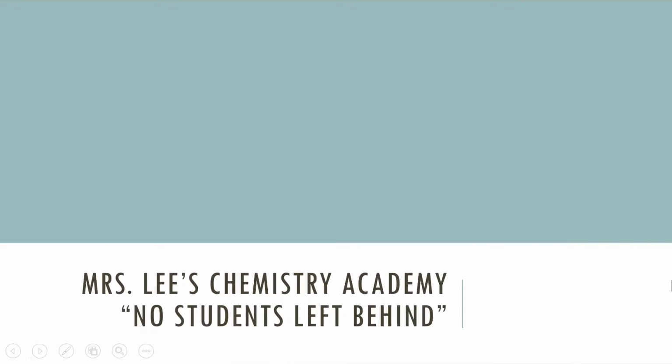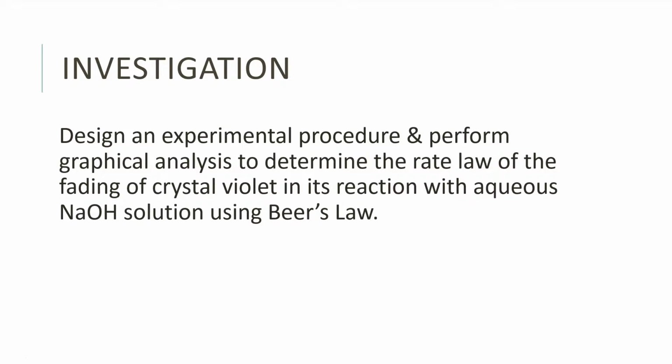Miss Lee's Chemistry Academy, Lab 6, a kinetic study of crystal violet reaction. Investigation. In this investigation, you will need to design an experimental procedure and perform graphical analysis to determine the rate law of the fading of crystal violet in its reaction with aqueous sodium hydroxide solution using Beer's law.